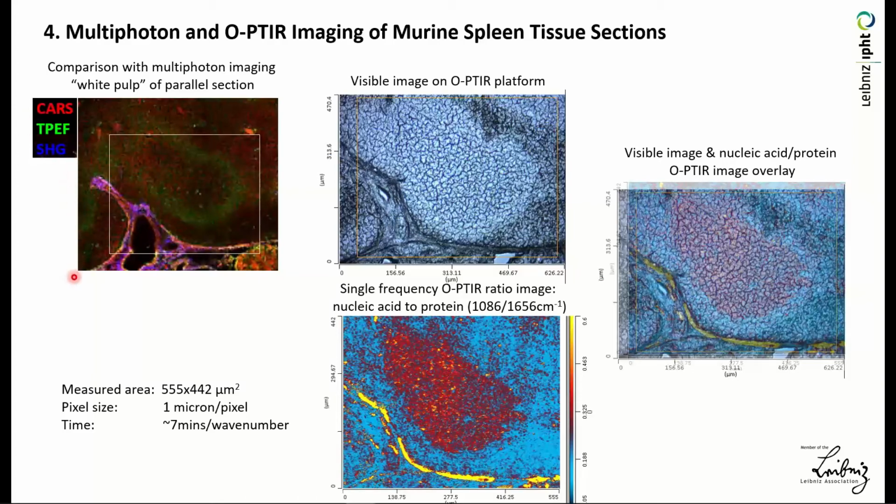The samples were prepared on a calcium fluoride slide for infrared spectroscopy, but we were able to identify the same follicle.